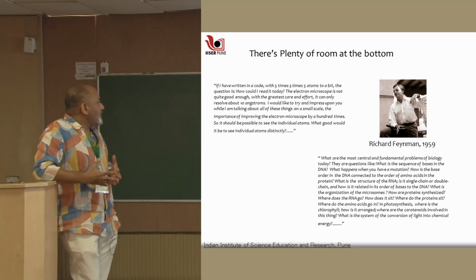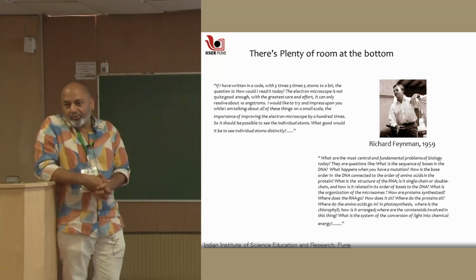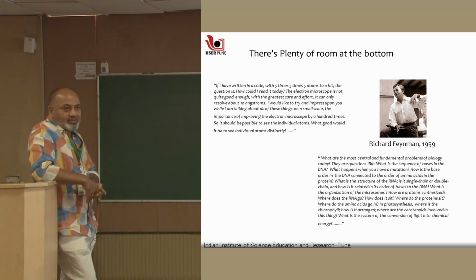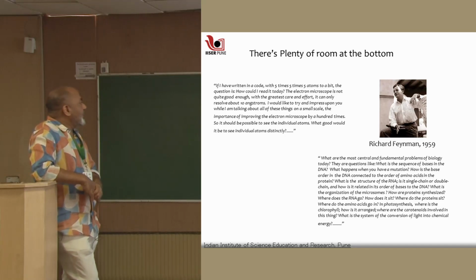And he says, what are the most central and fundamental problems of biology today? This is quite relevant for today's topic, right? Atomic force microscope for biology applications. There are questions like, what is the sequence of bases in the DNA? What happens when you have a mutation? Many of these problems are now solved. So it's 1959, please note that.